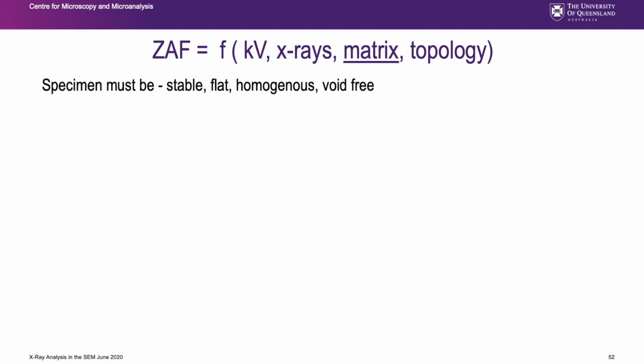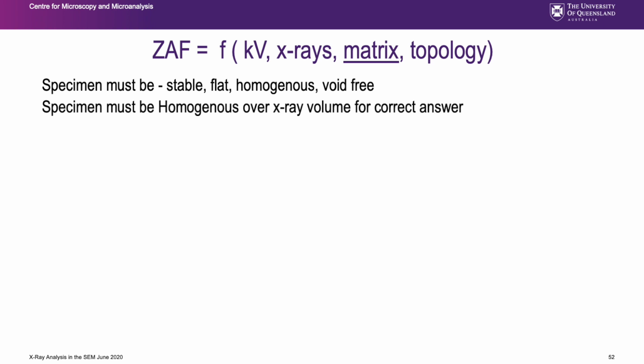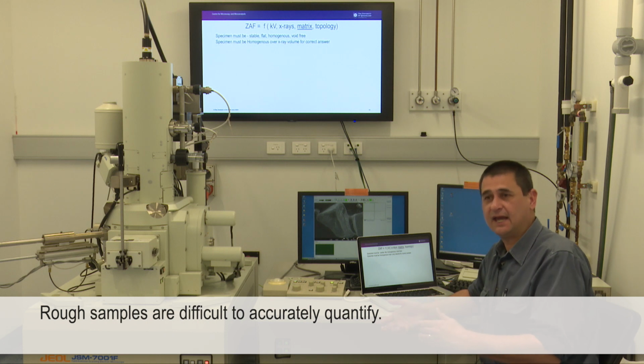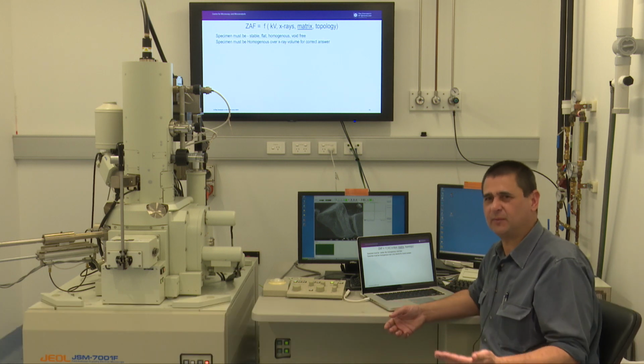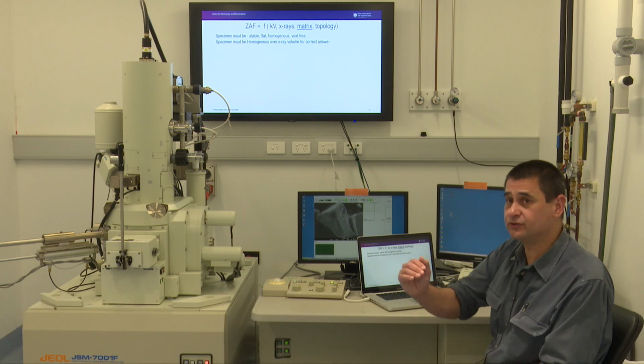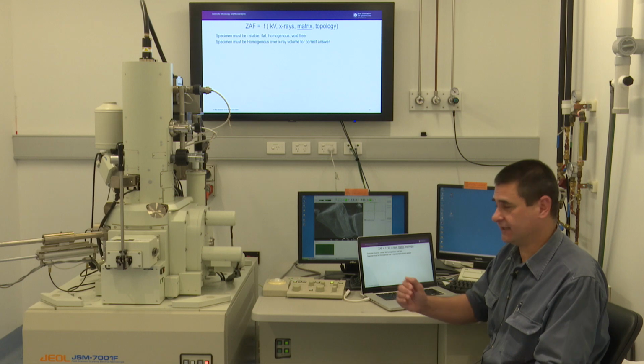When I come to the shape or the topology of the specimen, basically I have to make the assumption that it's stable, flat, homogeneous, void-free. I've just got to make that assumption. So you have to give me a flat specimen. You don't have to, but if you want to do accurate quantification, you do. If you've got a rough specimen, it's much more difficult to accurately quantify, and the big issue is it's probably got some errors in there, but I have no idea what those errors are. So I can't tell you whether it's high or low and which elements and by how much. All you can do is a good job or a bad job in X-ray analysis.